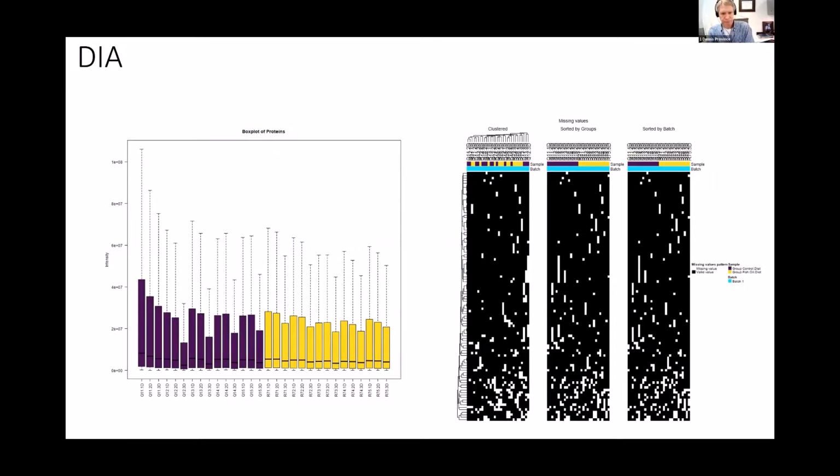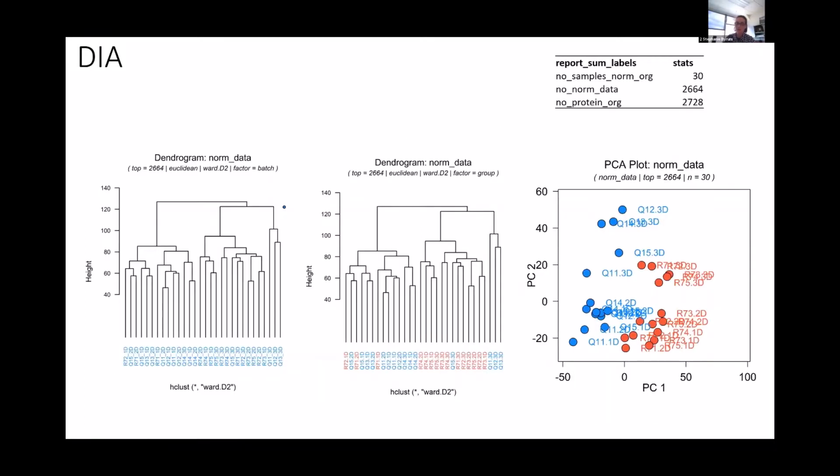I appreciate that. Okay, DIA, same samples. Now we're just running through DIA, and you can clearly see the difference here in our missing value chart. We don't have those big blocks of missing values and that batching effect like we did with the others. So that is a huge benefit of the DIA. However, instead of having 4,600 or however many we have, we now only have 2,700, 2,600 proteins identified. So you don't get the depth, but you get fewer difficulties in the analysis.